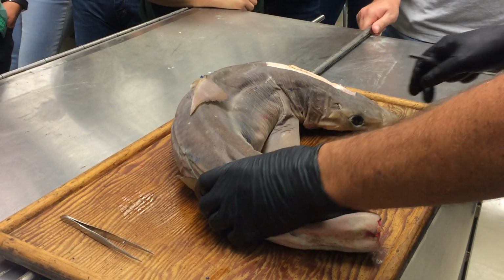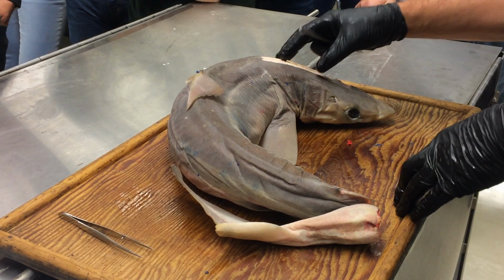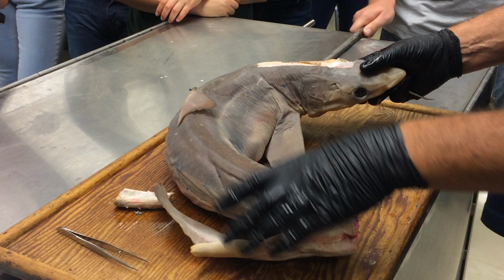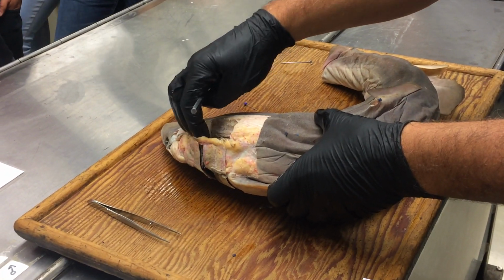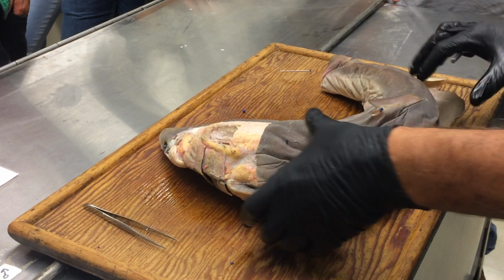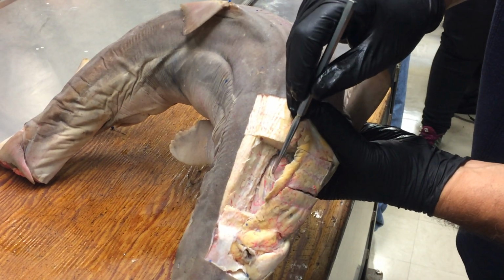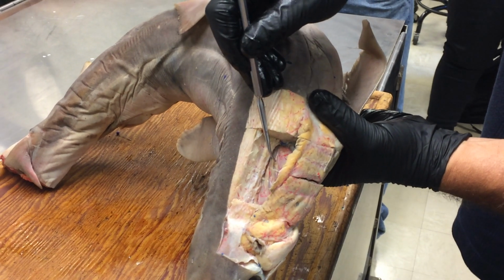Then there's some muscles associated with the branchial arches that are kind of deeper and harder to find. So what I did is I removed this whole chunk of epibranchial musculature so people could get a really good view of this. You don't necessarily have to do that on your chart. What you do need to do is separate the cucularis and levator hyomandibulae away from the epibranchial muscle and look under it. And if you do that, what you can see in this region is some thin slips of muscle that run along like this. And what we're doing is we're looking down on the top of the branchial arches.